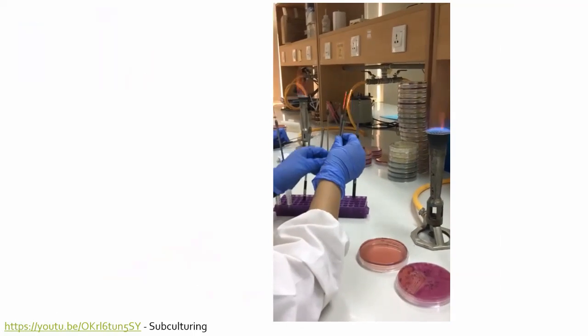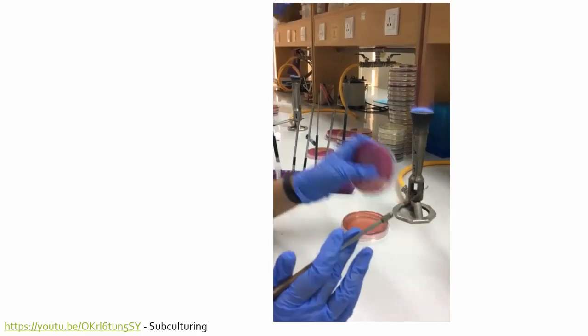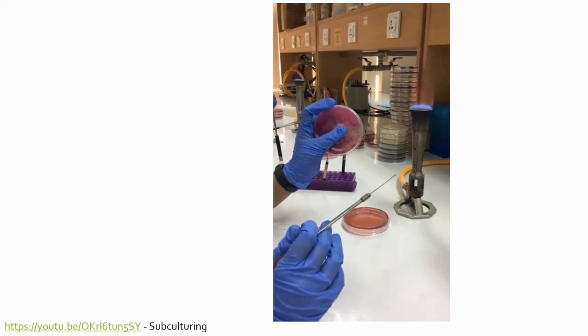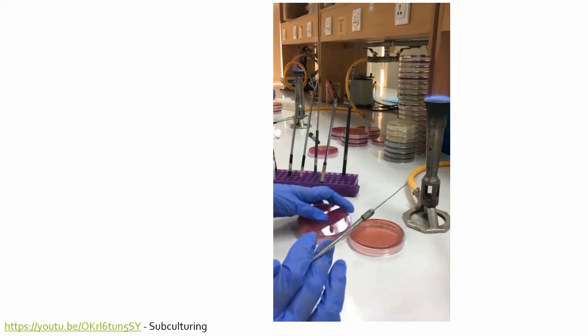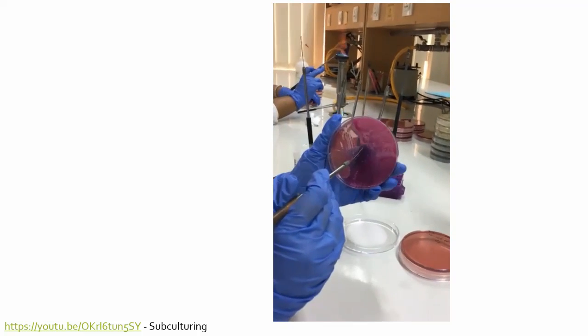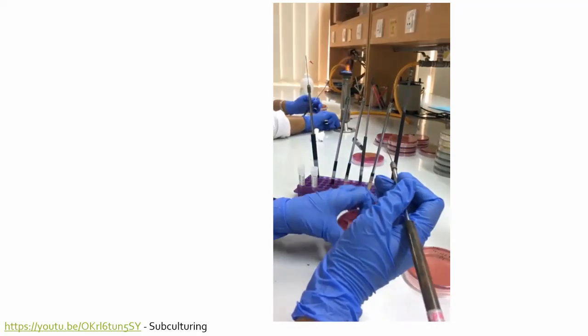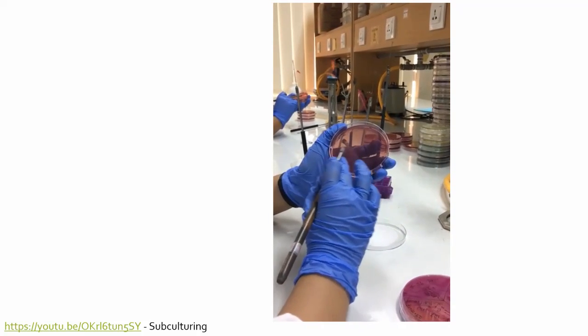So here this person is showing how to do it. Maybe he is using some flame between two burners. He may start. It's like sometimes scraping. Colonies are there. Using the loop, you scrape it and transfer to another.